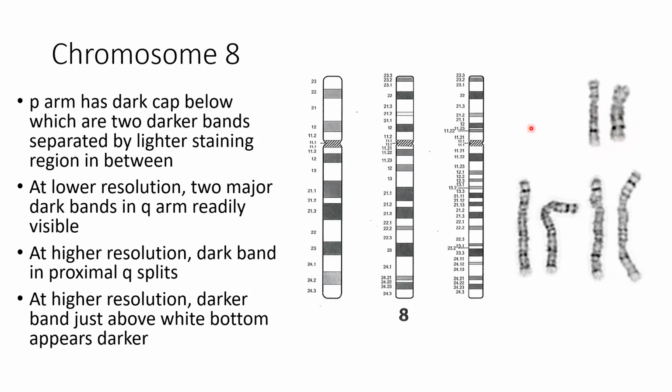You'll hear some of the technologists talk about a fluffy area on the chromosomes, and when you hear that, they're simply meaning a very lightly stained area.